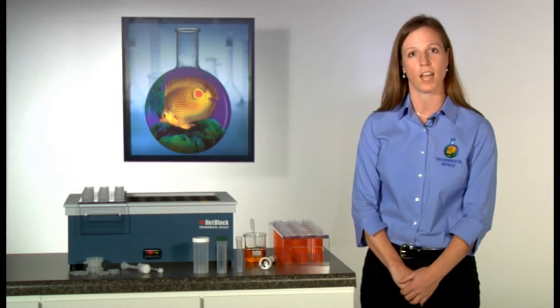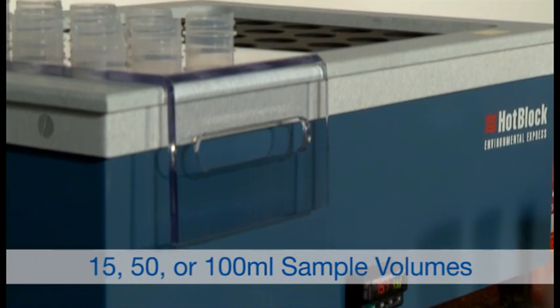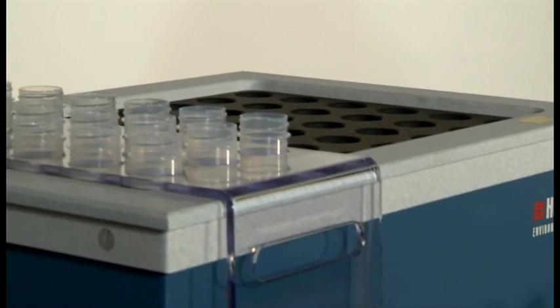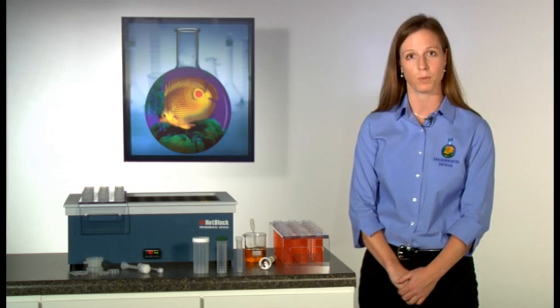Our blocks are designed with wells to accommodate sample volumes of 15, 50 or 100 milliliters and are designed for use with the Environmental Express digestion vessels which are disposable polypropylene.